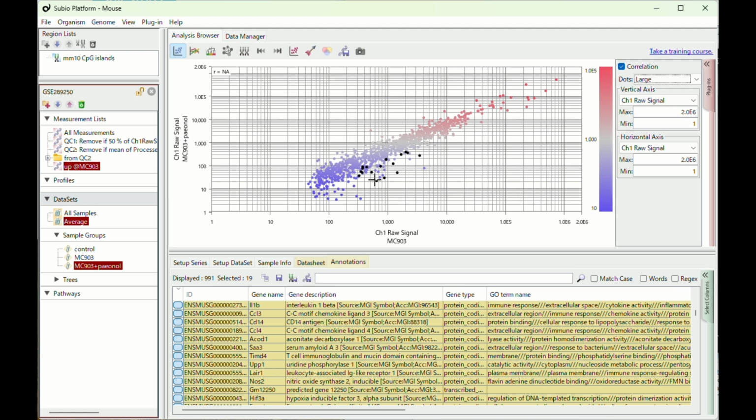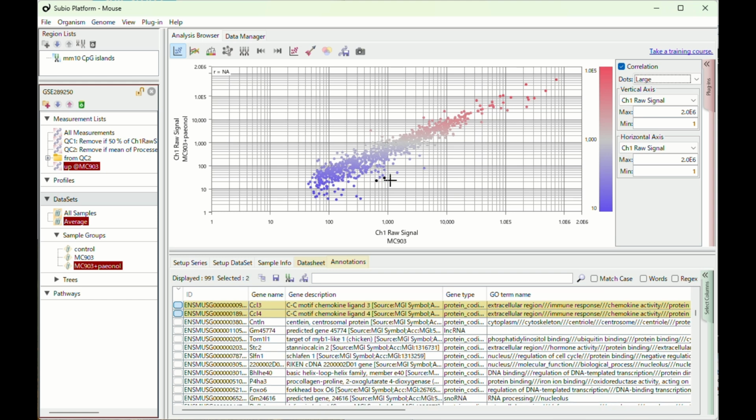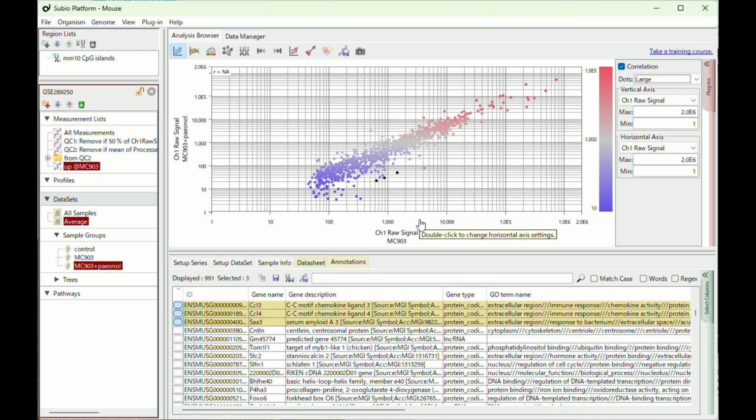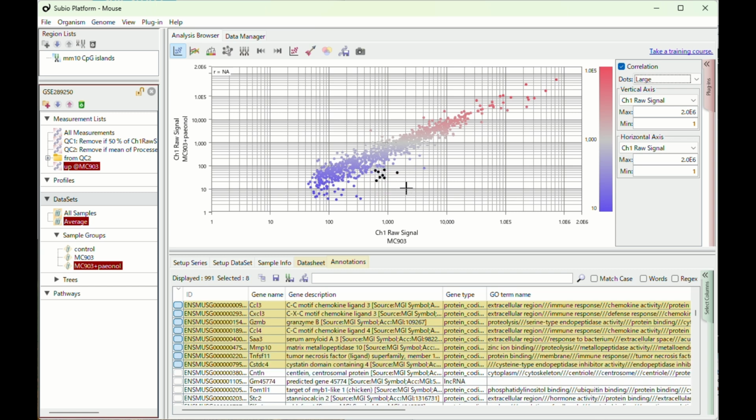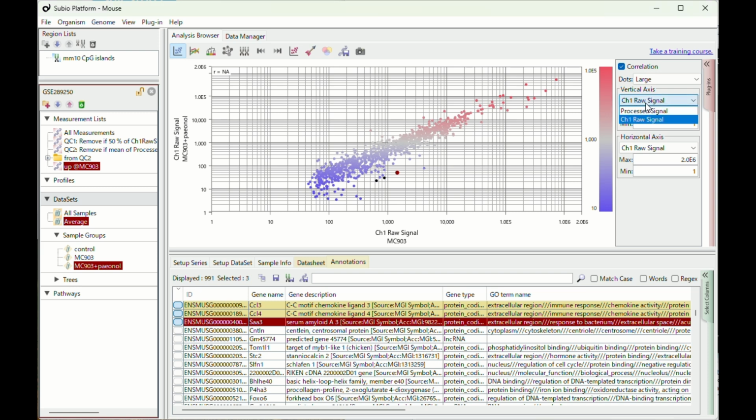You can incrementally select the 3 genes while pressing the Shift key. Or you can do it by pressing the Control key to invert selection. Clicking a row in the annotation table highlights the associated dot in the scatter plot. Their gene counts drop by about 10-fold.